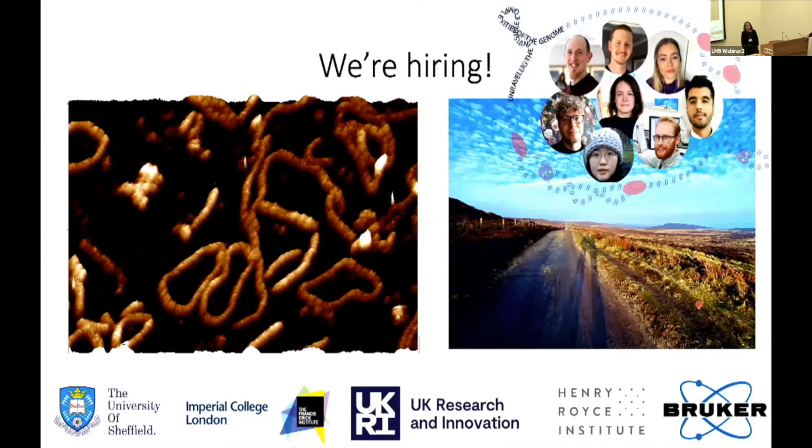Thank you. That's a really fascinating talk. I was just wondering if you can potentially compare chromatinized and non-chromatinized DNA, especially how it folds. Oh. So AFM's a surface technique, so we like to look at the top of things. The bigger and more complicated they get, the more you're just looking at the top of them. What's really nice here is I'm showing you lines and blobs in terms of DNA and protein. And the more blobs you add in, the more complex it becomes, because one of our big secrets is we don't have any chemical identification. So blobs are blobs are blobs, unless they're very size separated. So challenging, I would say.